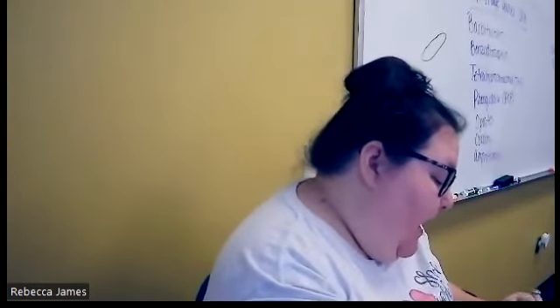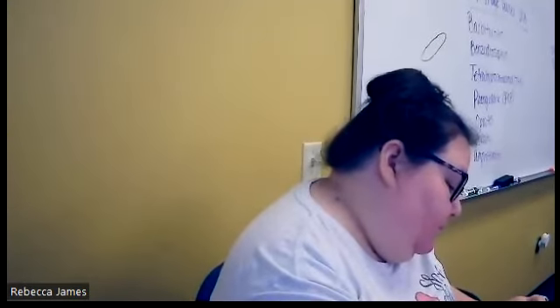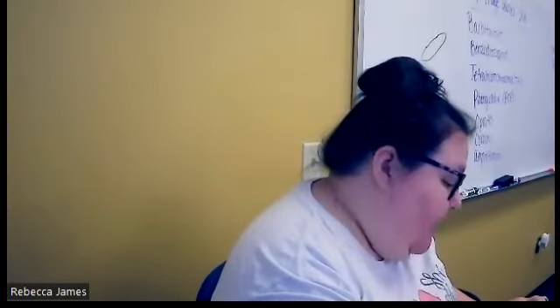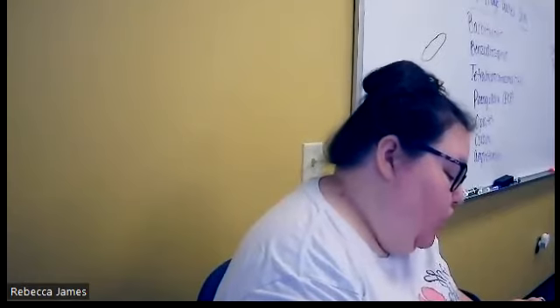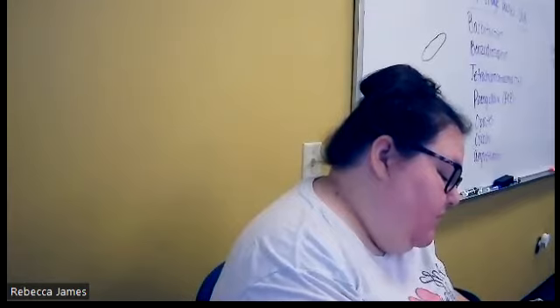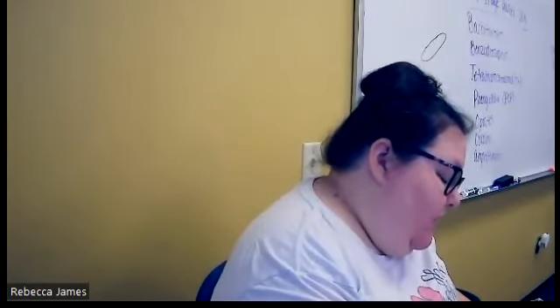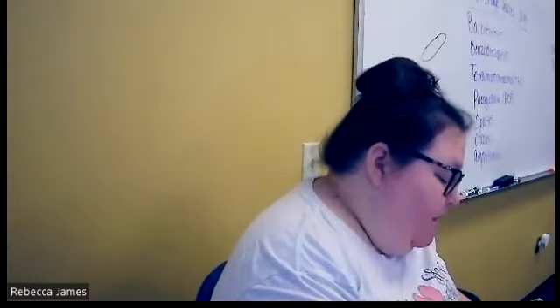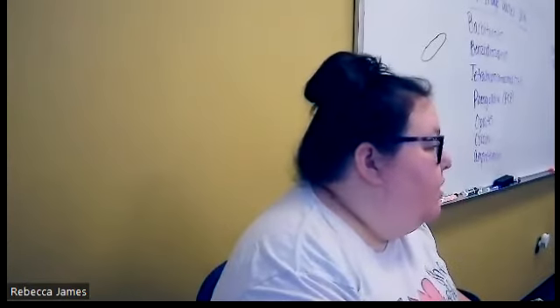So if you turn back to 635, and you're looking at that chart, Trichomonas vaginalis. Okay, you see the flagella at the top. That undulating membrane is that blue part right there that's going down.